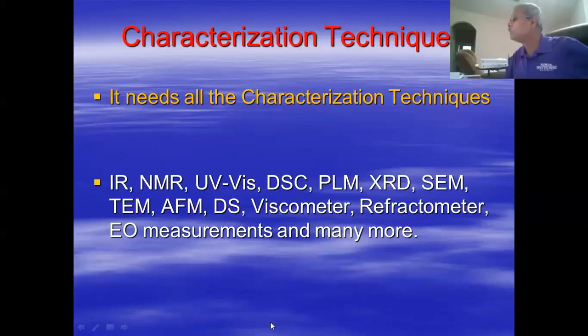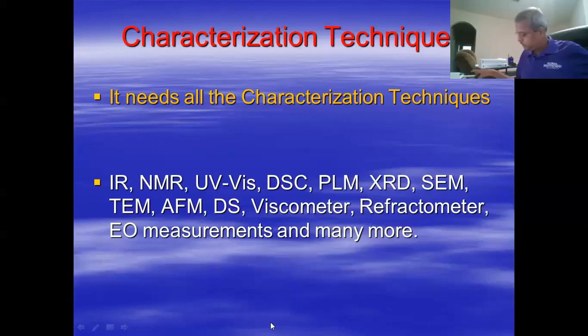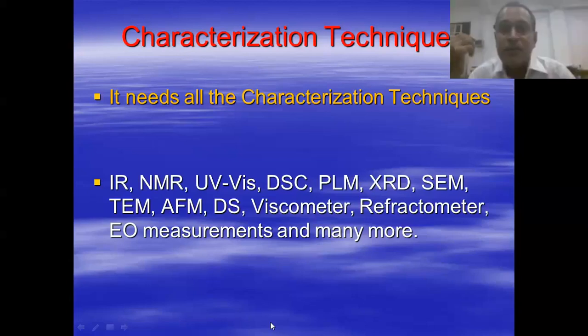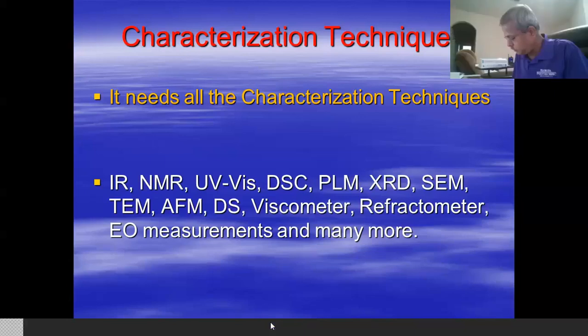We need a viscometer for the study of liquid properties. We need a spectrometer. We need electro-optical measurement and many more. In the short span of 30 minutes, I cannot cover all these techniques. I will try to cover three of them if possible: thermodynamic characterization, polarized light microscope characterization, and dielectric spectroscopy.